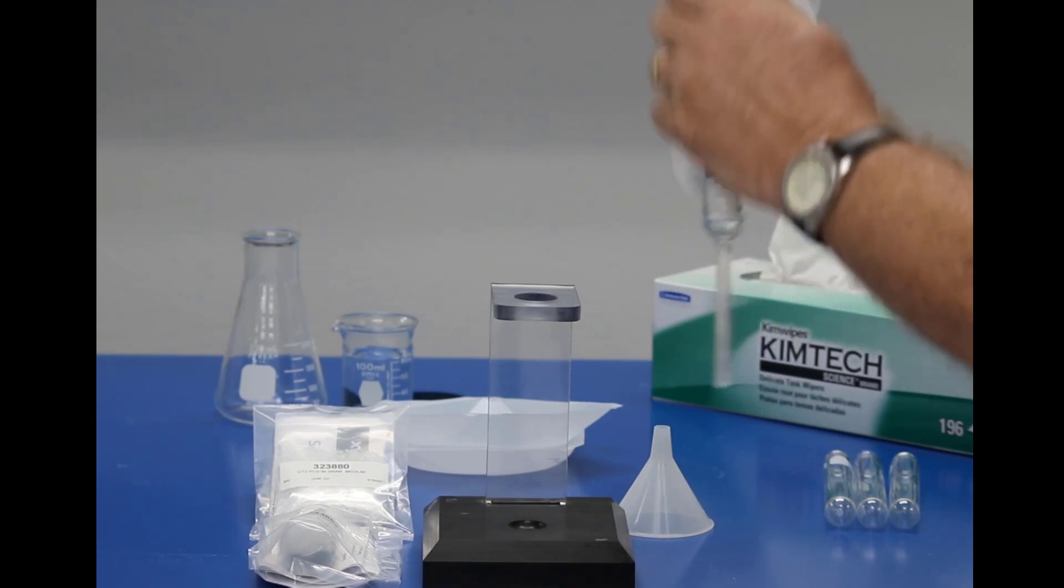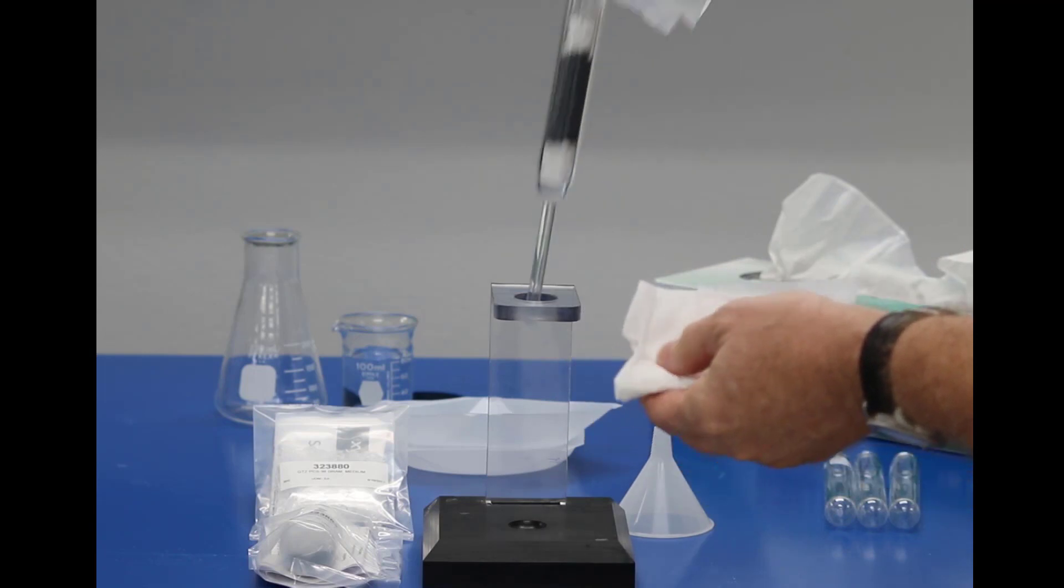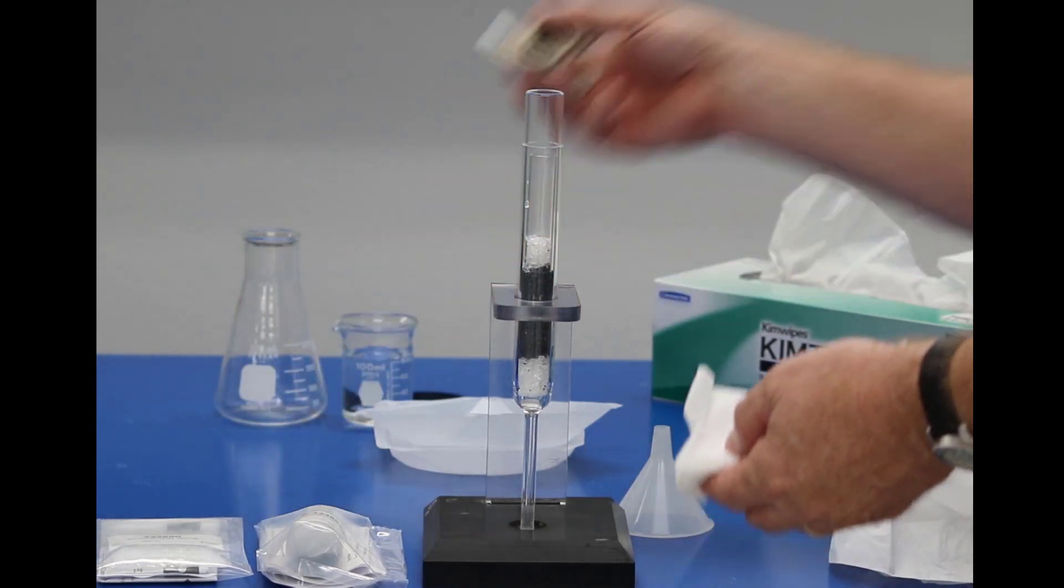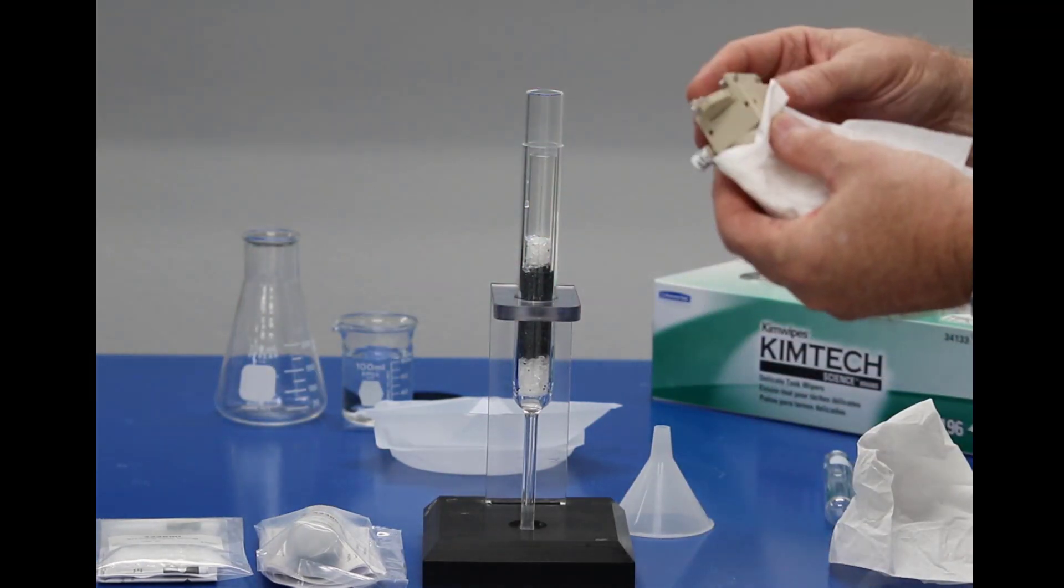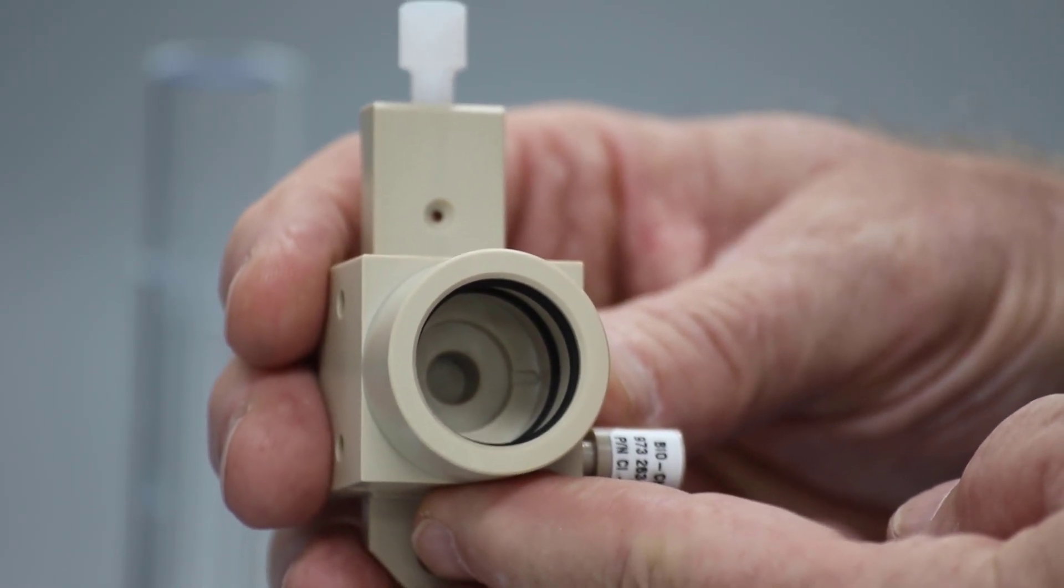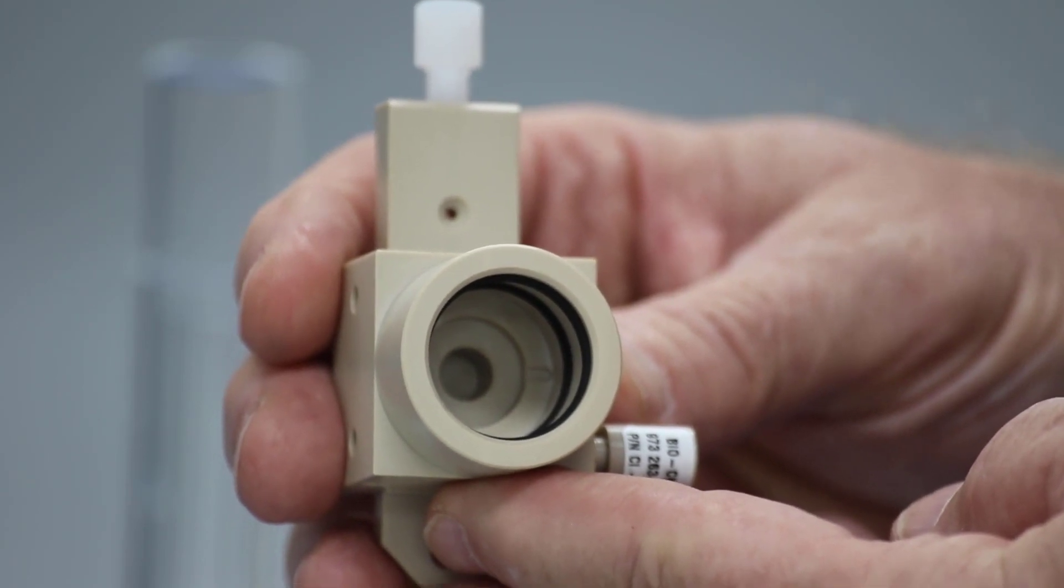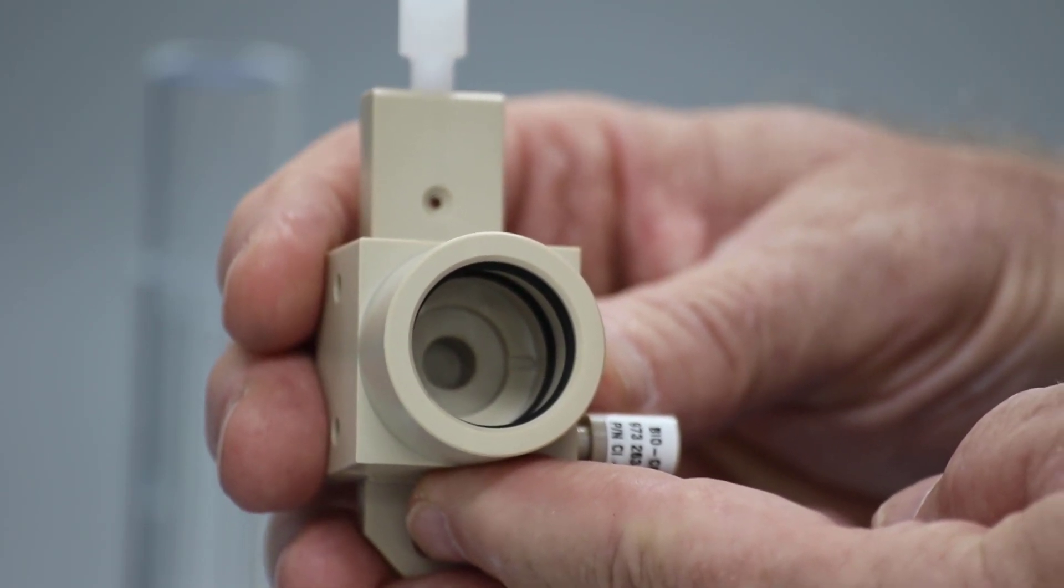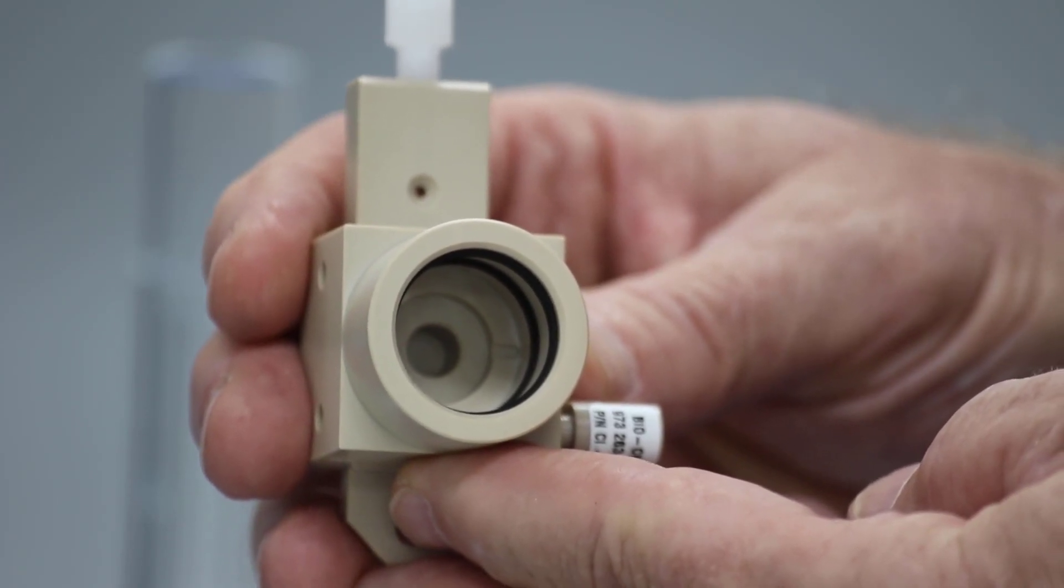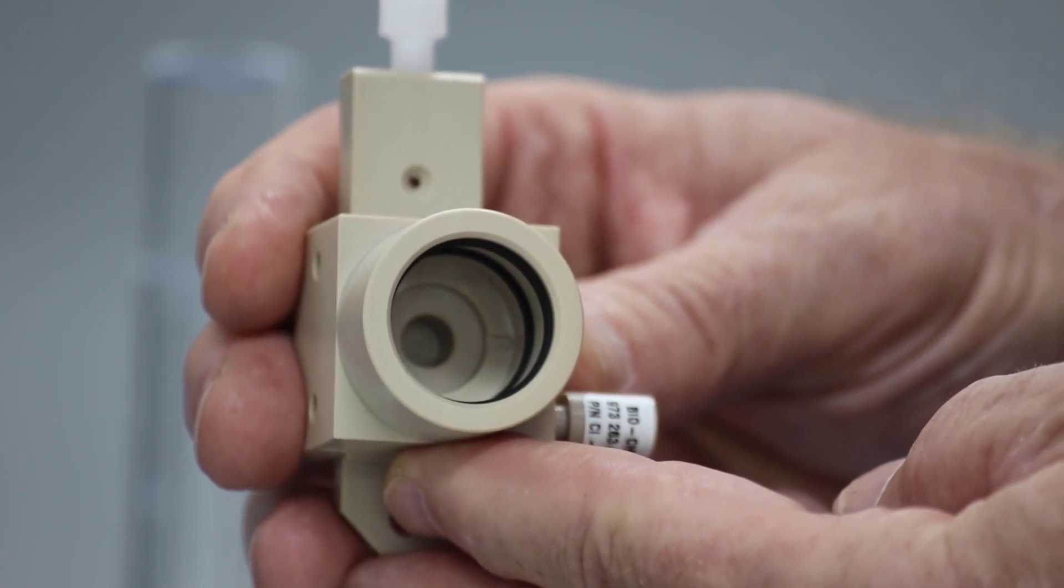And before we install it into the furnace, we will need to install the cap and slider assembly. The cap and slider assembly has two O-rings that you can see inside, and when we install this, we want to ensure that it fits snugly down onto the top of the combustion tube, so that both of those O-rings will seal.